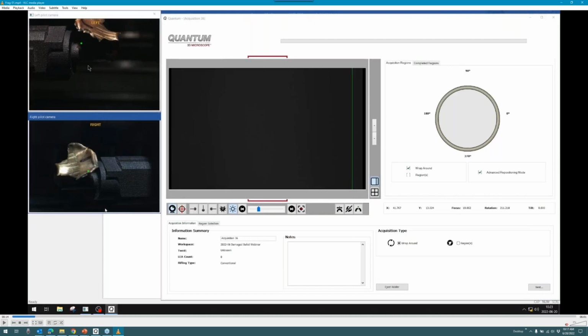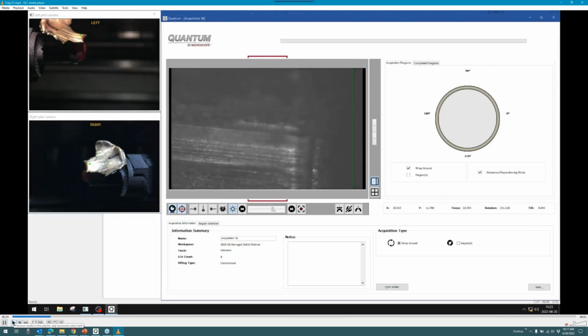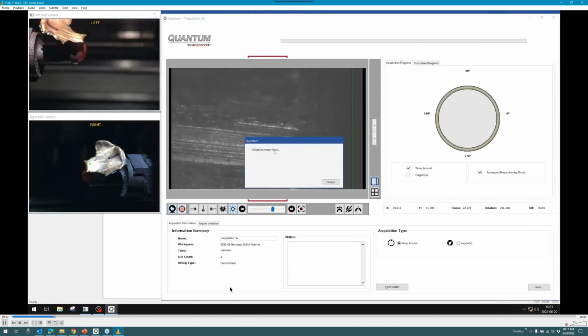The green square here is showing you the area that the photo box here is currently looking at. And so the mouse on screen is just appearing inside the lower window here. It's going to come up and it's going to click on the base of the fragment right near the tail of the fragment here. It's going to do the same thing over here, and then the mouse is going to come over to the crosshair button right next to the pilot camera button. So I'm identifying where I wish for the bullet to move to, and then it moves to that area underneath the camera. So I quickly found the base of the bullet.